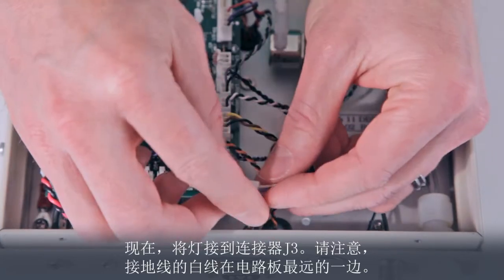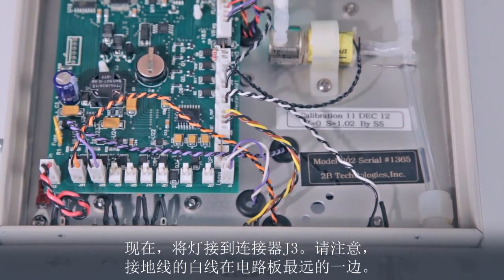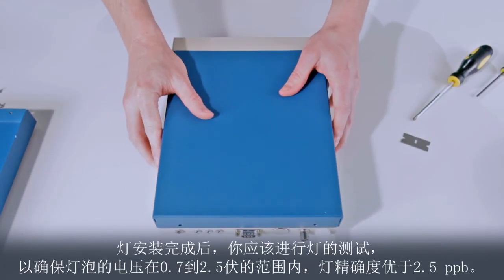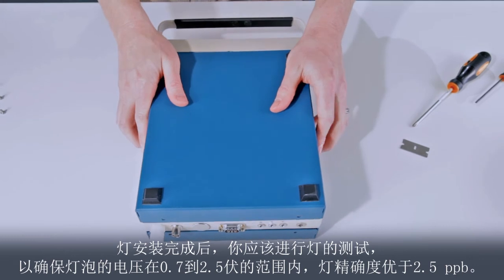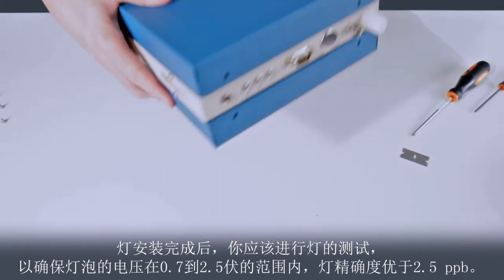Now plug the lamp into connector J3. Notice that the white wire, which is the ground wire, is furthest from the edge of the circuit board. We may now replace the top and bottom covers. After completing the lamp installation, you should run the lamp test to make sure that the lamp voltage falls in the range 0.7 to 2.5 volts and the lamp precision is better than 2.5 ppb.